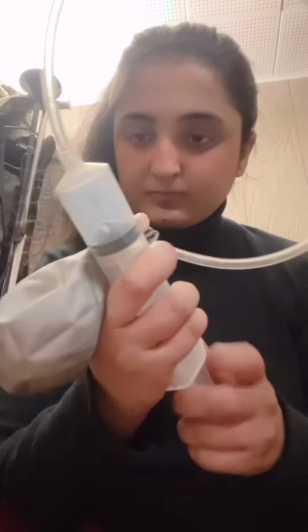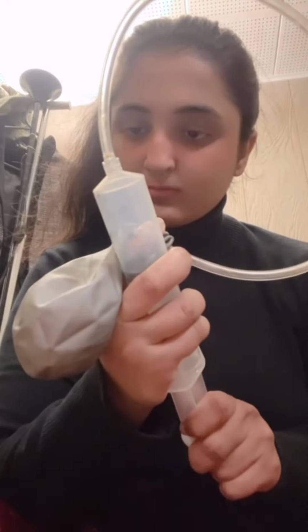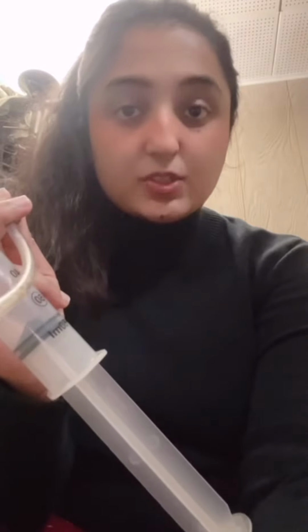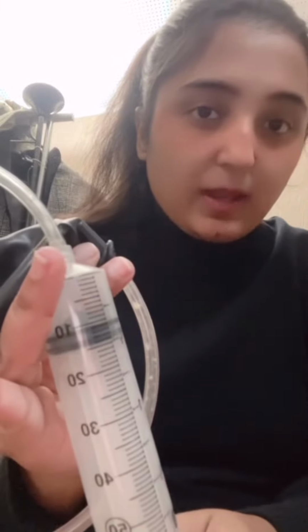It turned out to be 48 ml. For the 150 ml sugar container, the carbon dioxide is 105 ml. Let's start for the container with 200 ml of sugar. For the container with 200 ml of sugar, it comes to be 160 ml of carbon dioxide in the balloon. For control, it comes up to be 10 ml of carbon dioxide formation.